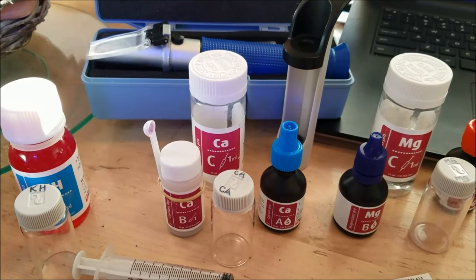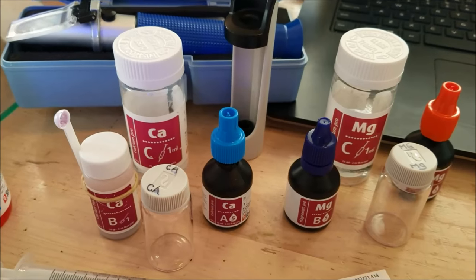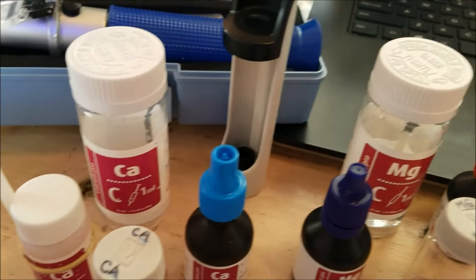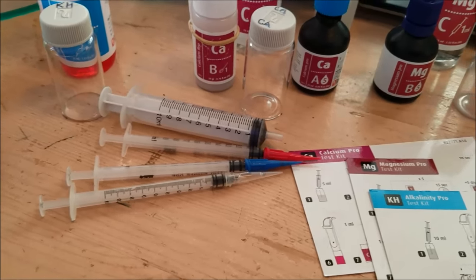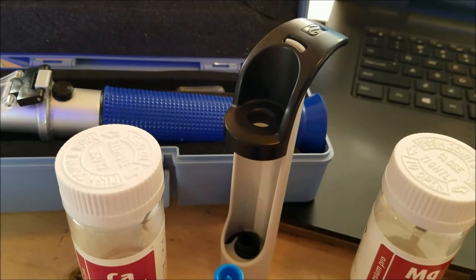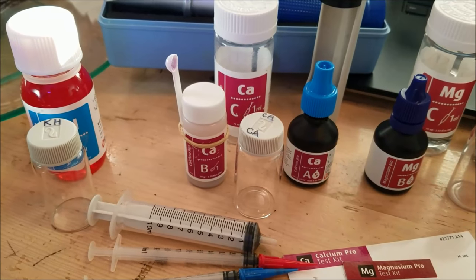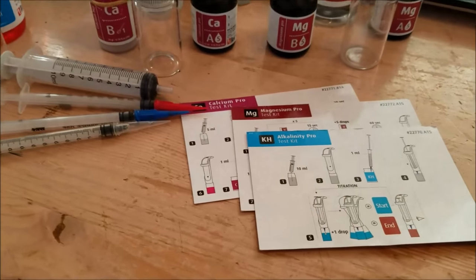I plan on doing a video going into each product that I test with on a weekly basis. This is the Red Sea Reef Foundation Pro Test Kit, and it comes with alkalinity, calcium, and a magnesium test, along with all the reagents, syringes, and the titrator. This is a test kit I've used throughout my time in the hobby — I trust it, I've used basically nothing else, and it's never failed me.